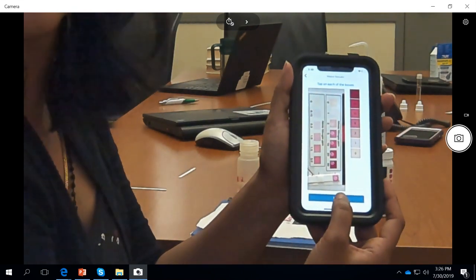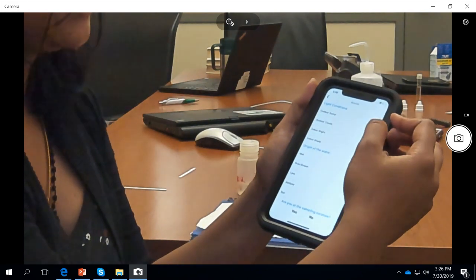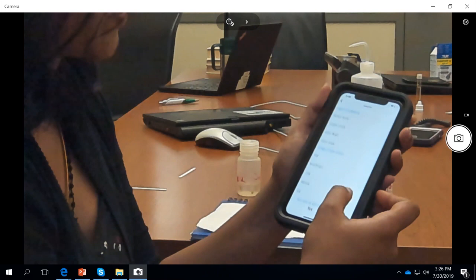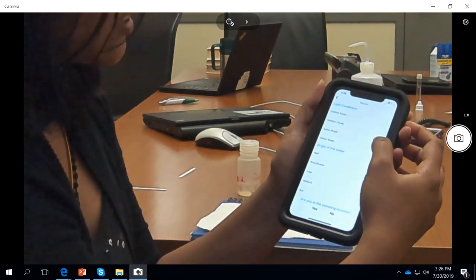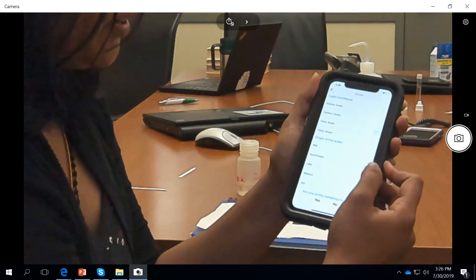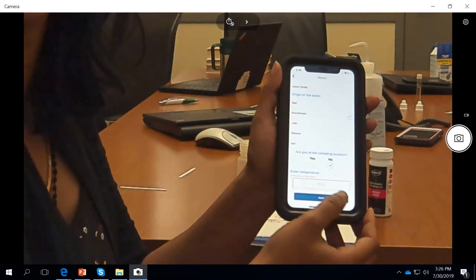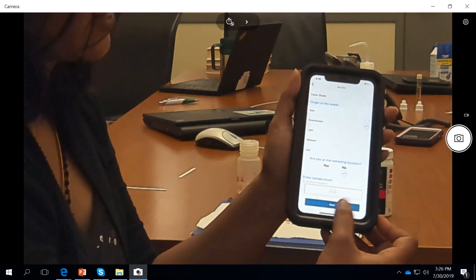And then press next. So you have options to input the light conditions, origin of water, whether you are at the sampling location, such questions. So mine is light condition indoor bright, origin of water lake river, I'm not at the sampling location, and then there is one more option to enter the temperature, but I'm skipping that right now and then clicking next.